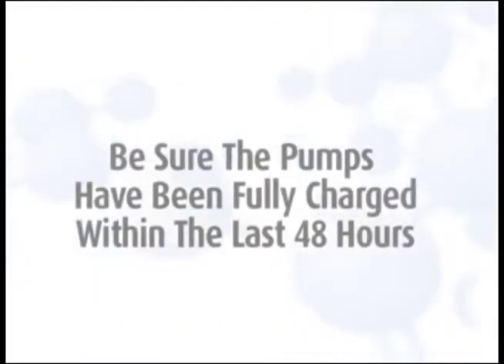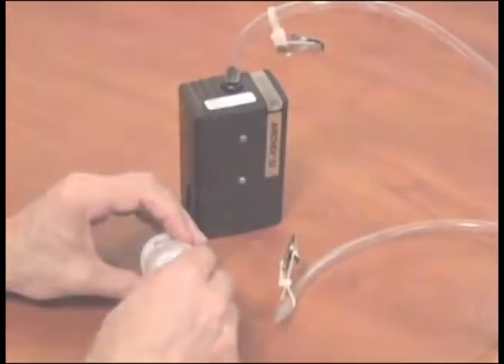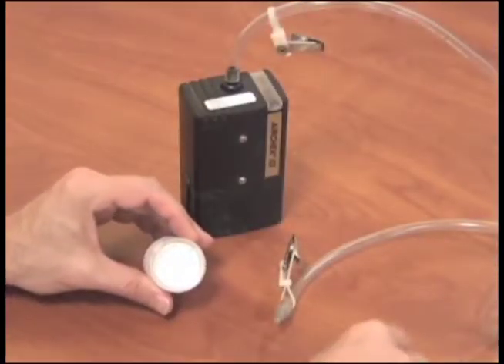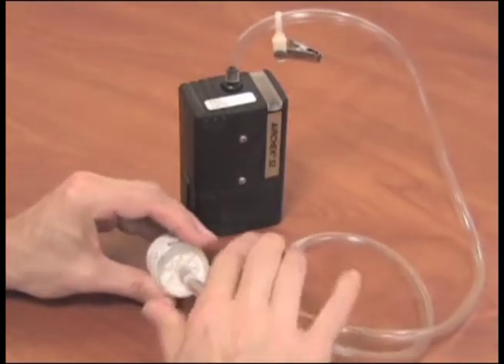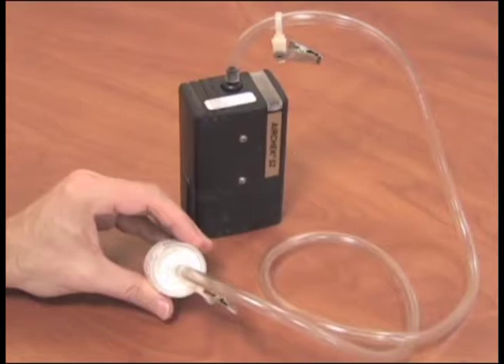To begin sampling, be sure that pumps have been fully charged within the last 48 hours. Remove the colored nib from the wagon wheel pattern side of the filter cassette and attach it to the pump tubing. Be sure the wagon wheel pattern is facing the pump.